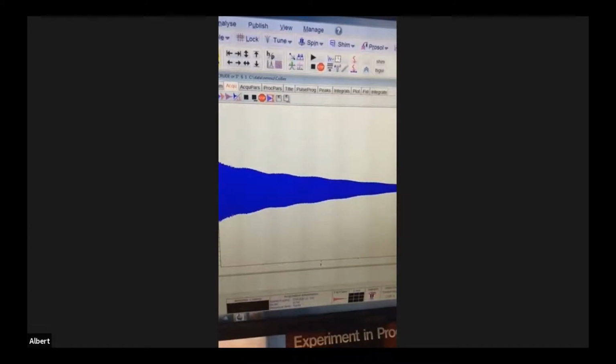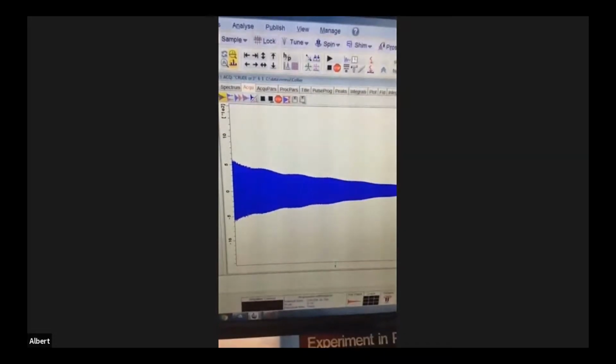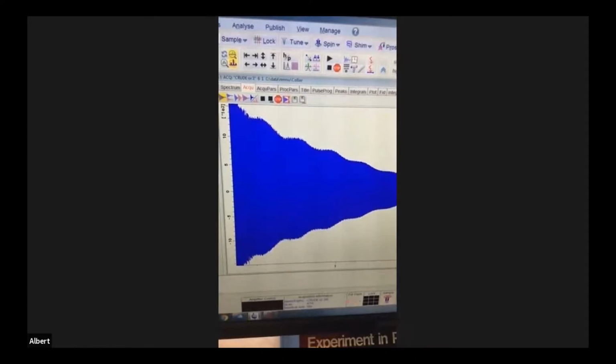Right? So that's going to keep going. And again, when you're running a sample for a Proton NMR, it's 16 scans. Right now it's on scan number 2. All right, so you can see it. Now it's on number 4. And after it's done, we can process it.